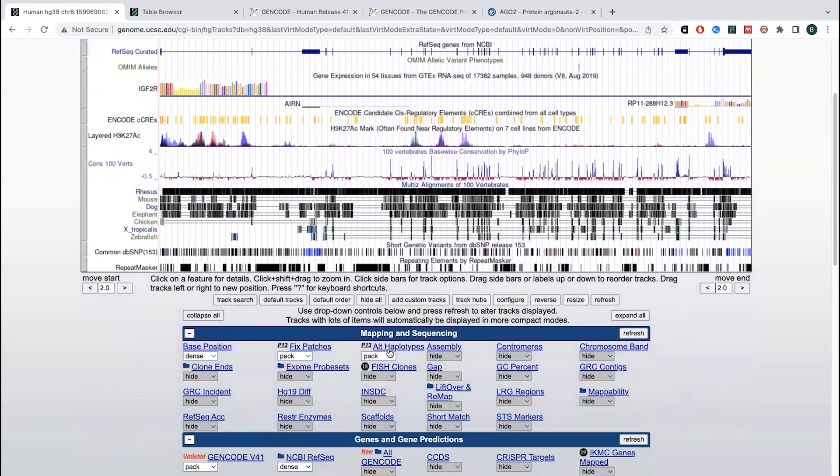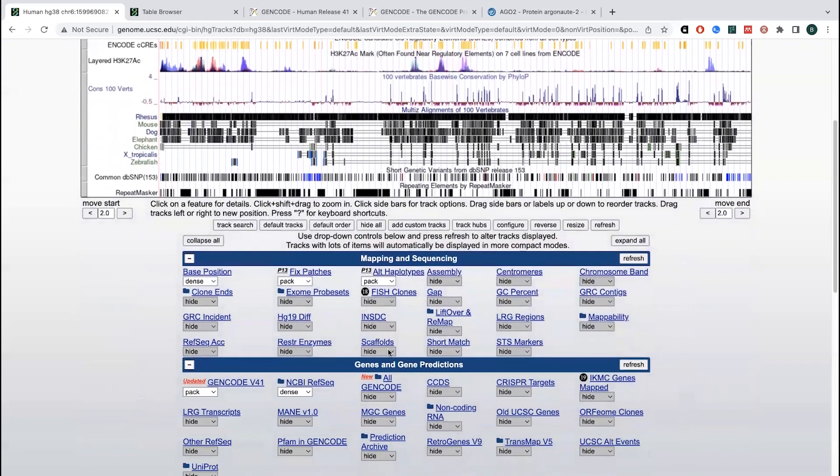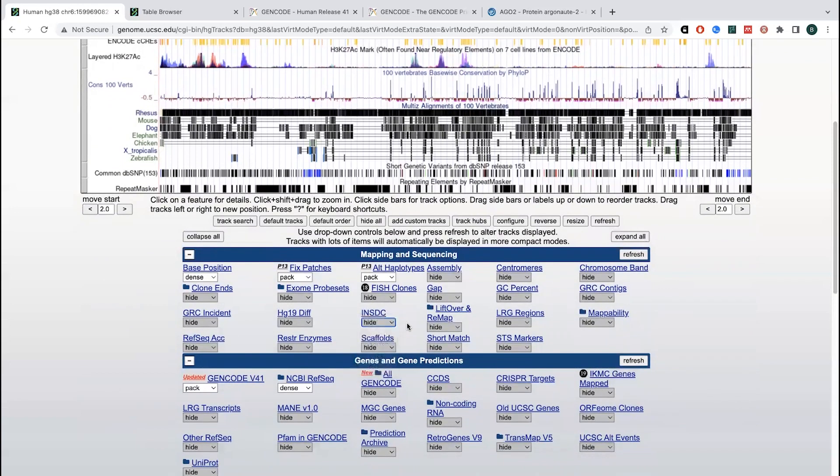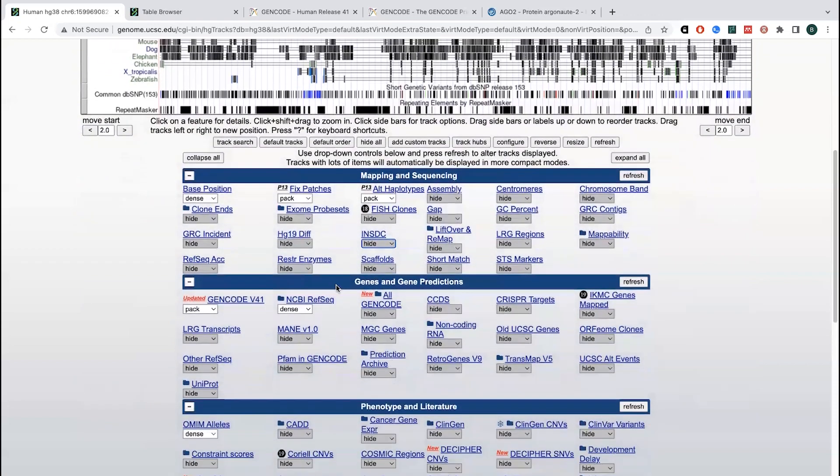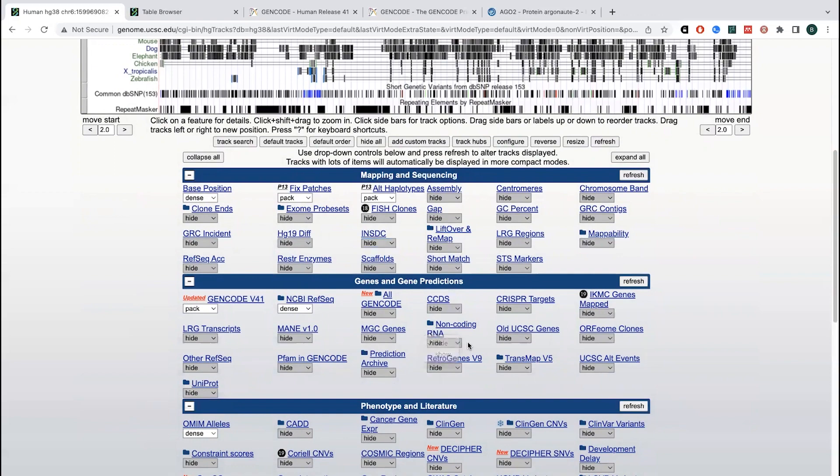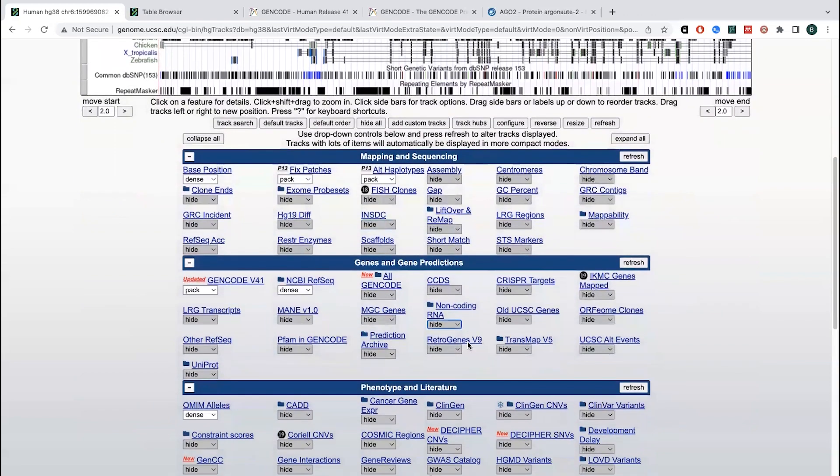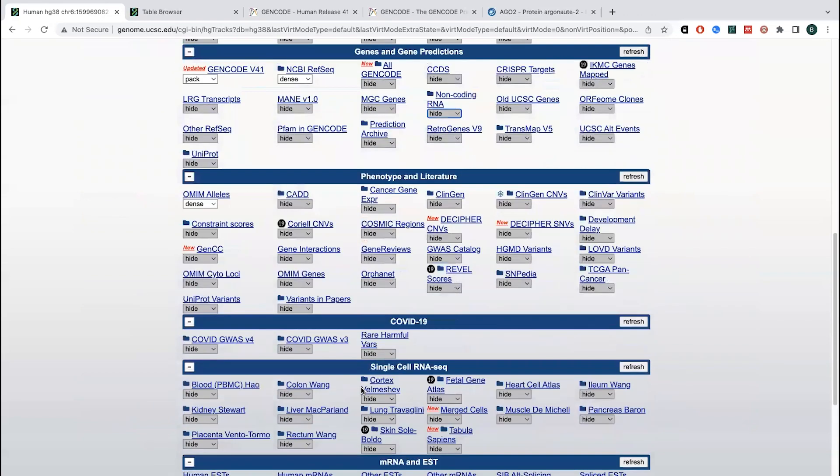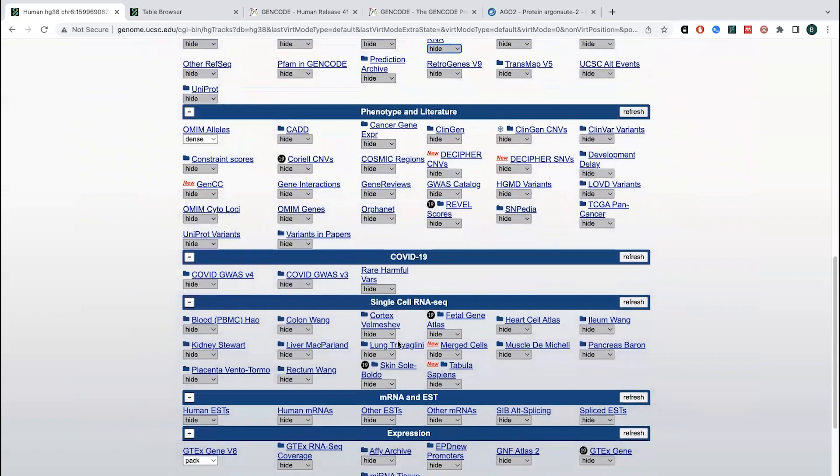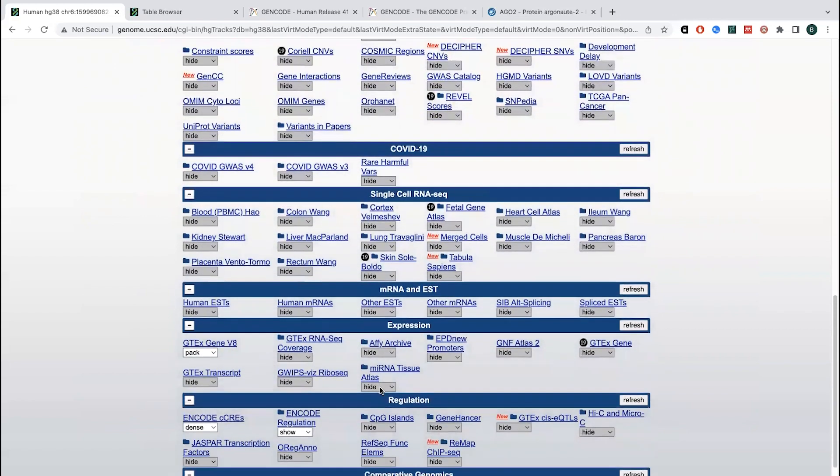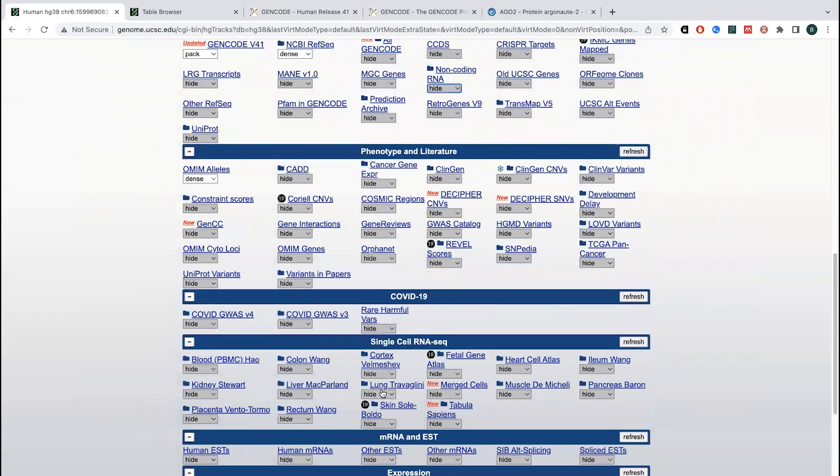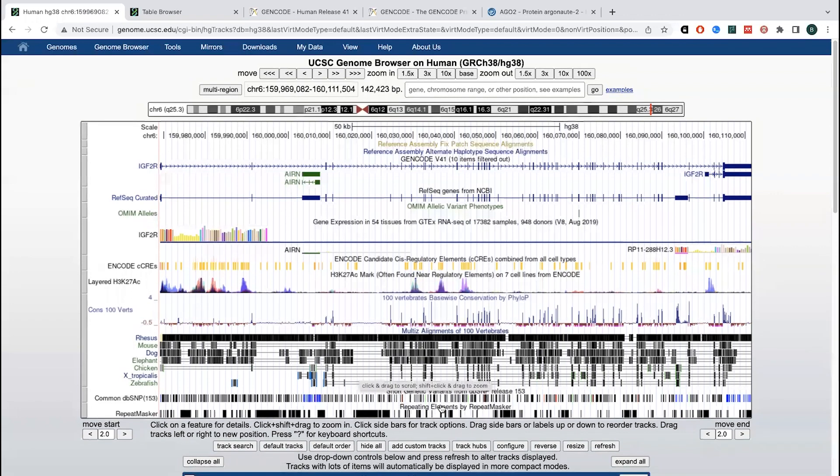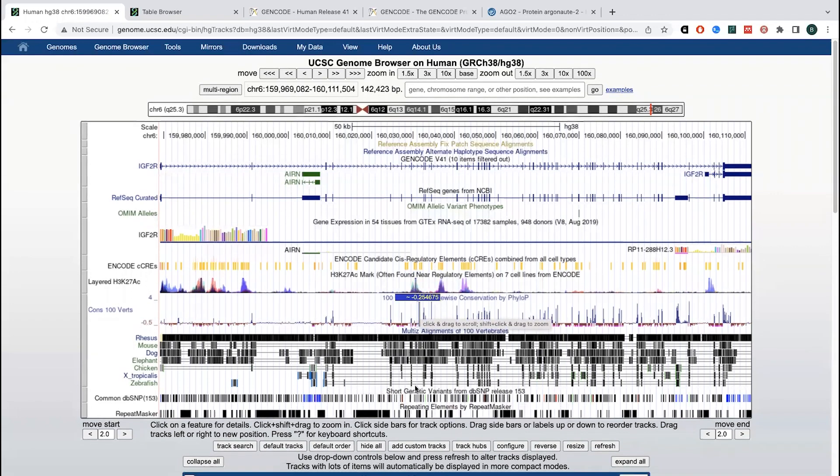But if you were to go and look, you wouldn't want to see everything all at once. It can be kind of overwhelming. This browser is going to allow you to basically choose what you want to show. Do you want to show all of the transcripts? Do you want to show non-coding RNA? There's a ton of different annotations, different databases, and different information that you can overlay on that basic information on that sequence.